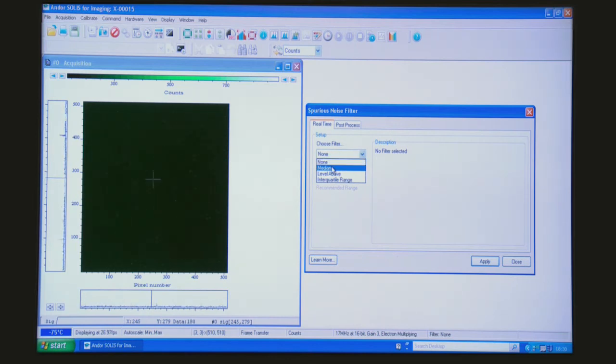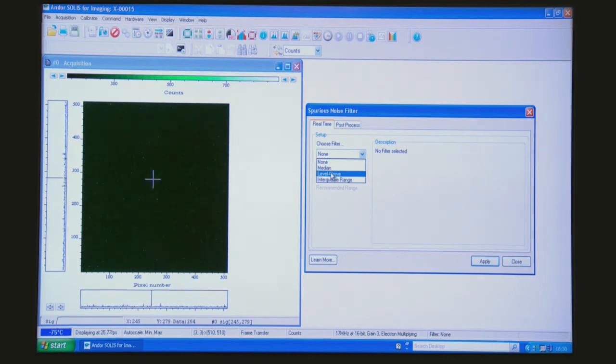So we have median, level above, and interquartile range. These descriptions are given within the manual of the EMCCD camera, so I'll not go into it here.